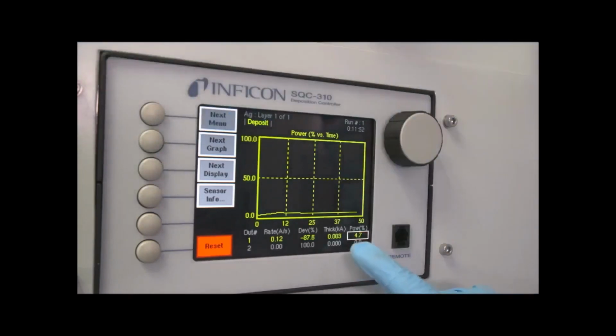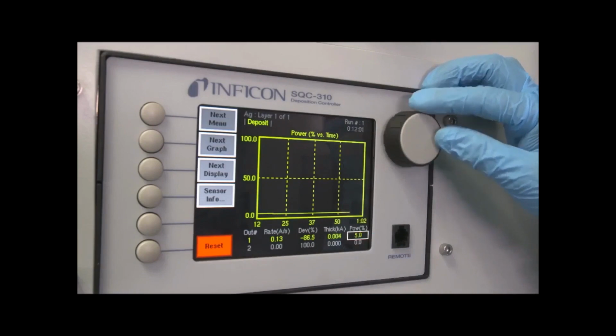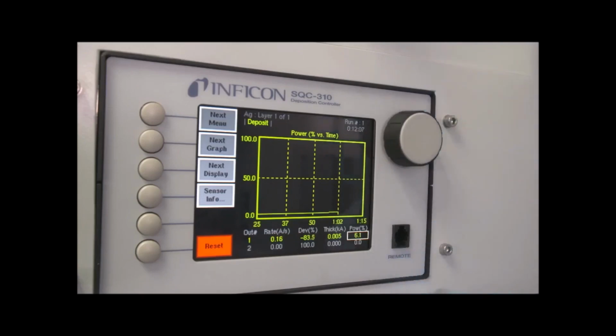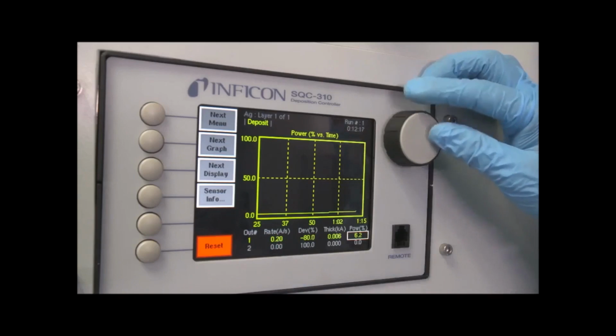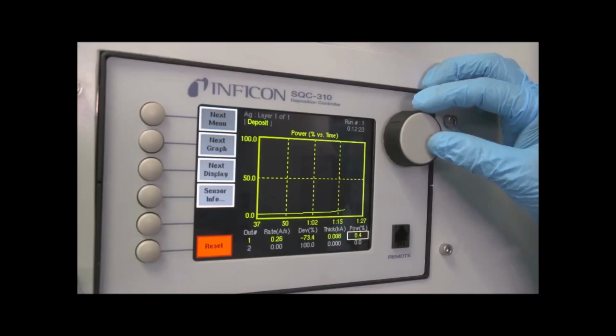As you can see, this is the thickness of the film that is being deposited. It's 0.003 kilo angstrom. So let's increase the power so that we can achieve a higher deposition rate. As you see the increase in power, you will see more reddish in the target material also. The deposition rate has increased to 0.19, 0.20 angstrom per second. So let's increase the power.